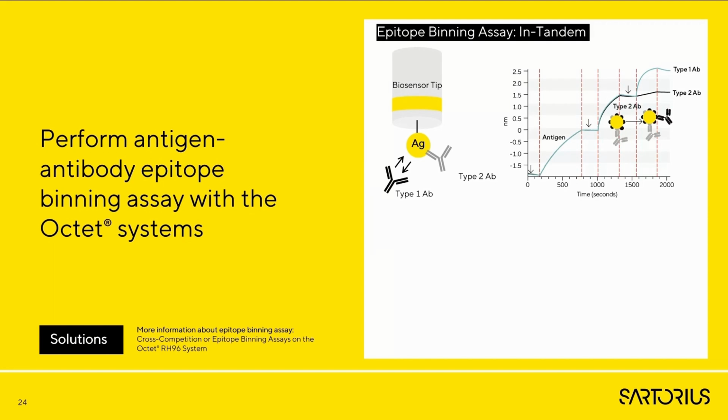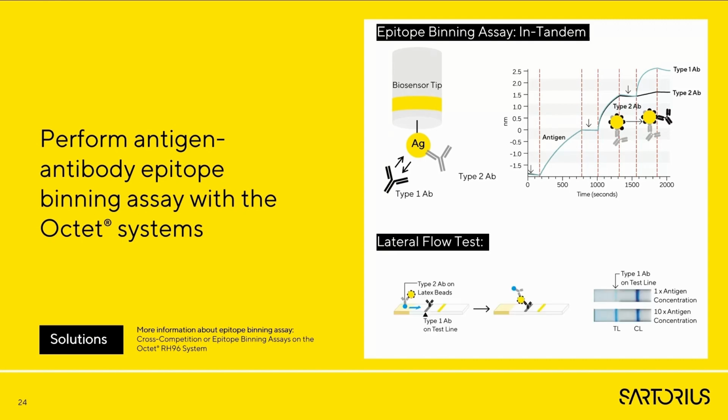If the antigen is bound to the type 2 antibody, which interacts slower and weaker than type 1, the epitope for type 1 antibody might be accessible. Consequently, the binding occurred with a significant shift in binding rate. Thus, in the test, the antigen was bound to the beads coupled with type 2 antibody. This binding was slower and weaker than that of type 1 antibody.